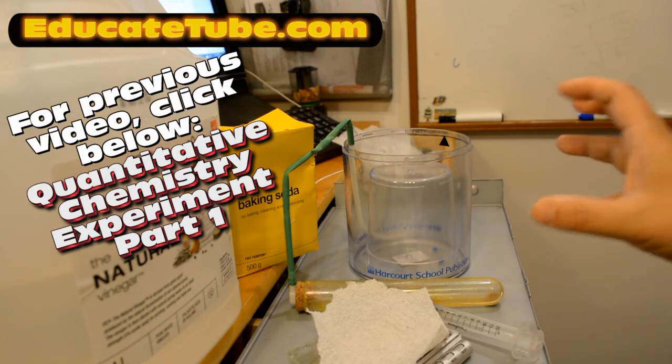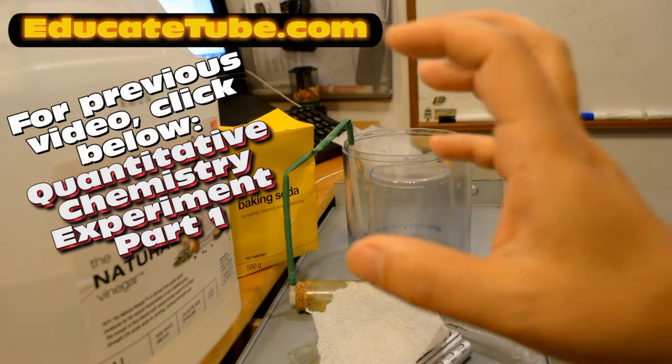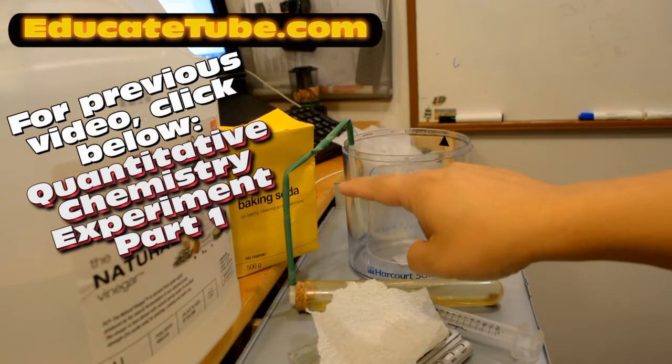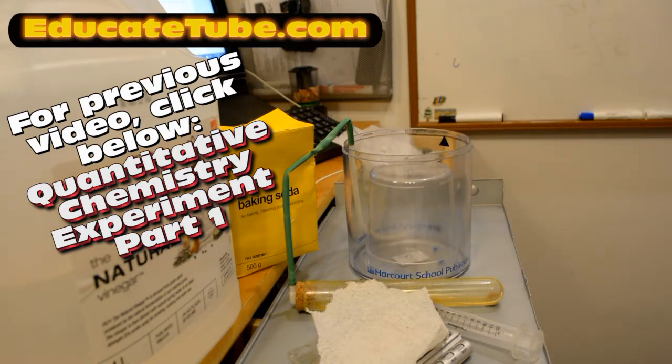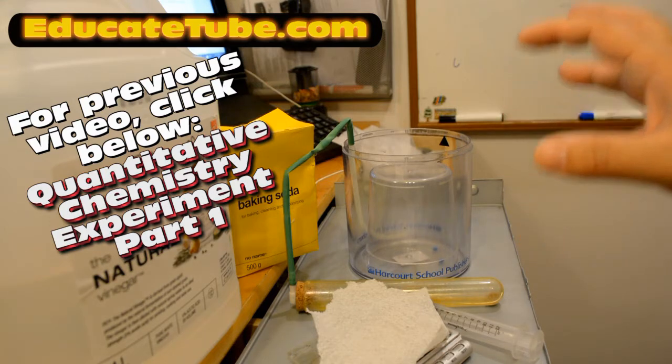Today I'm going to prove that if you add 20 mils of 5% acetic acid, which is vinegar, and 1 gram of sodium bicarbonate, which is baking soda, together, because from the previous video I calculated it to be 290 milliliters of gas, CO2, carbon dioxide, that will be produced in this reaction. So that's my theoretical yield.